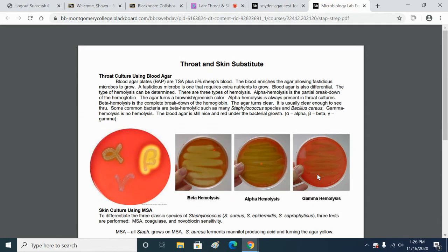You'd have to go to a doctor and get a strep test to find out. But like I said, it's usually fun for students to see what's growing in the throat, because it always surprises them how nasty their blood agar plates are. But that's typical and normal, right? Strep throat is very painful.